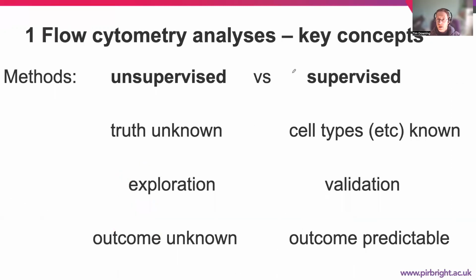So what we're using in general terms is a mixture of unsupervised methods that are statistically based and applied in R, and then also supervised intervention from yourselves, the experts, on identifying, say, you have markers that identify known cell types, whereas you might have other cells that have an unknown cell type. There's elements of exploration, especially with unsupervised methods, whereas with supervised methods, you might be trying to validate an existing data set or sample set that are of interest. And here for the unsupervised set, you'd expect an unknown outcome where you're not sure to what extent the different cell types are different, for example.